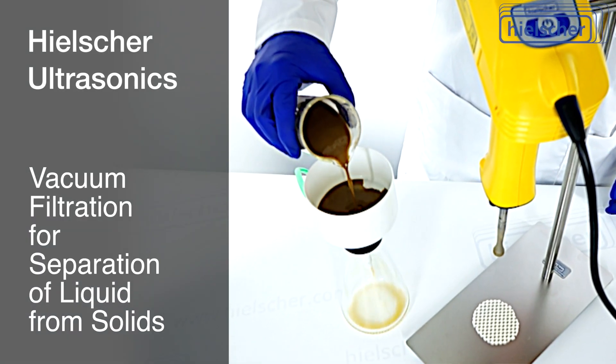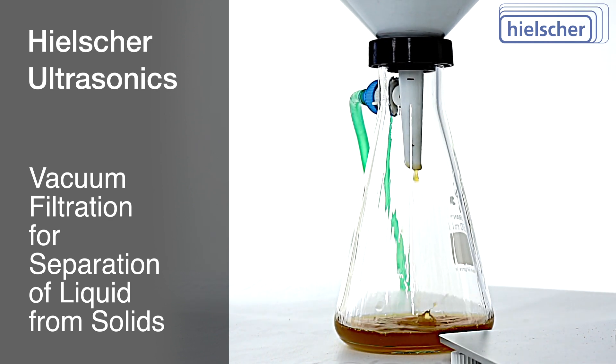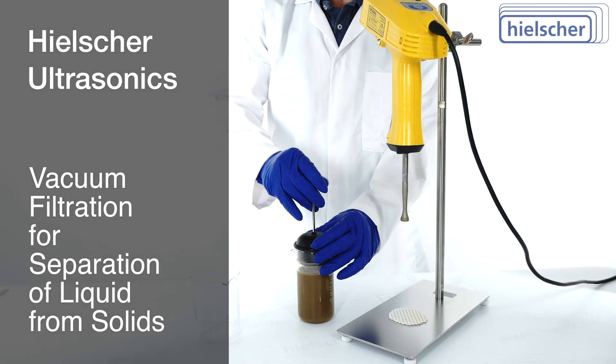After sonication, we use vacuum filtration to separate the liquid phase from the solids. You can also use any other filter, decanter, or centrifuge for separation.